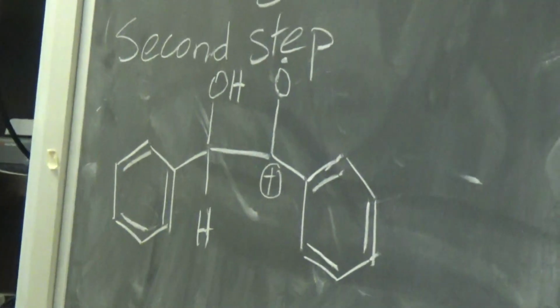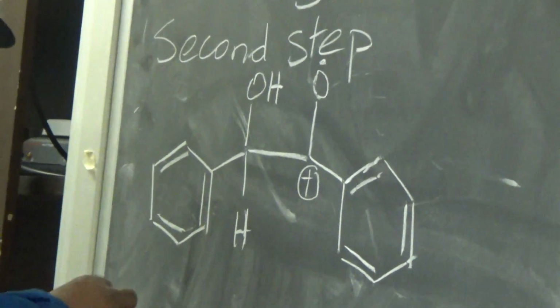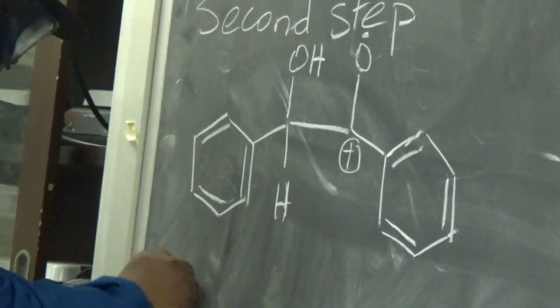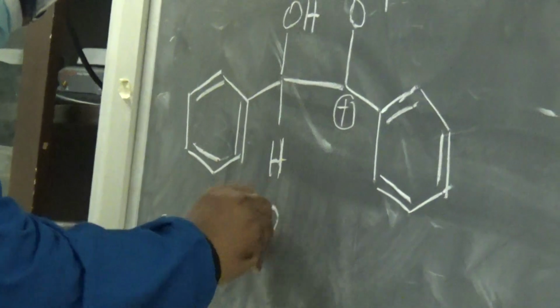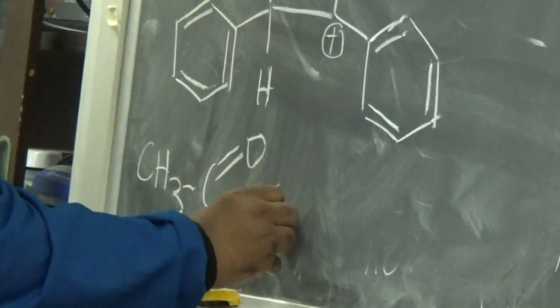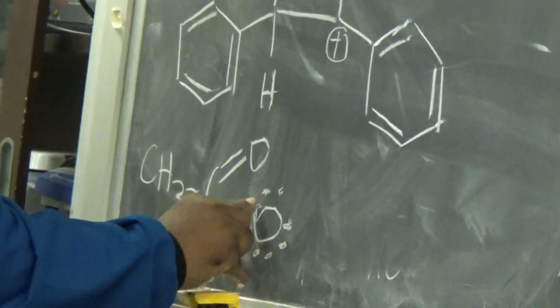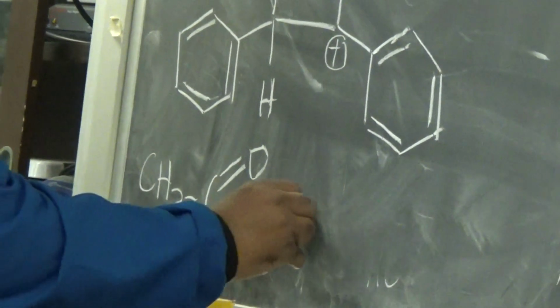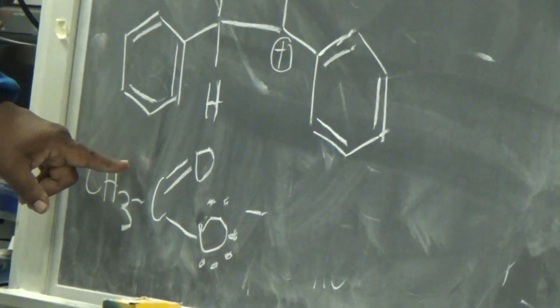Now that one is gone, what you have is the acetate anion.